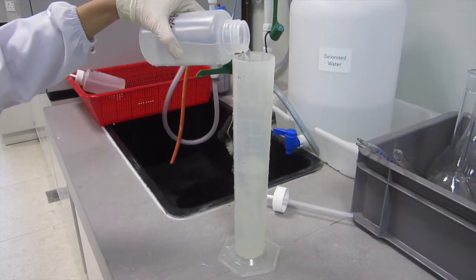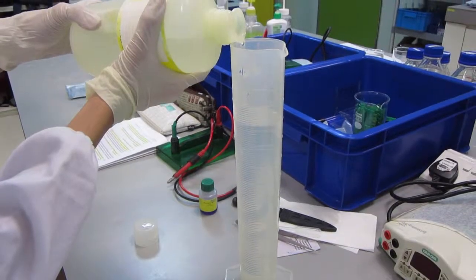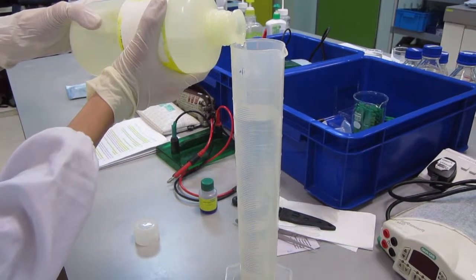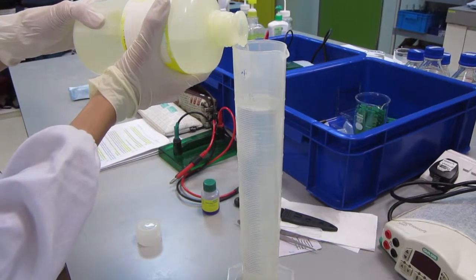Using a measuring cylinder, measure 450 milliliters of distilled water and top up with 50 milliliters of the tris-glycine SDS solution. This will form the electrophoresis buffer.